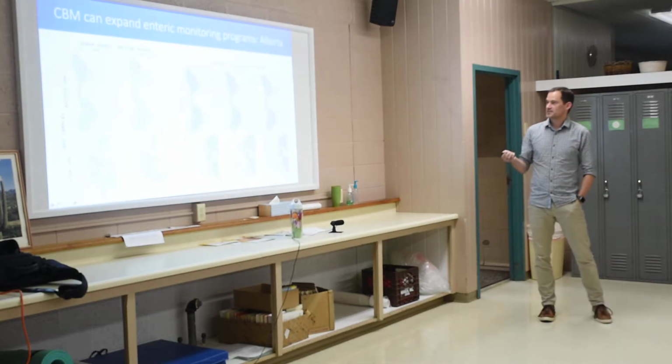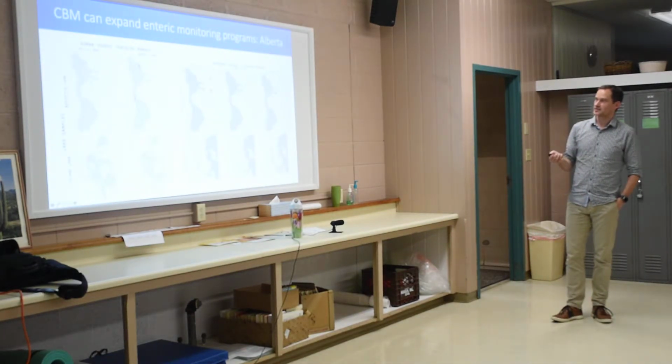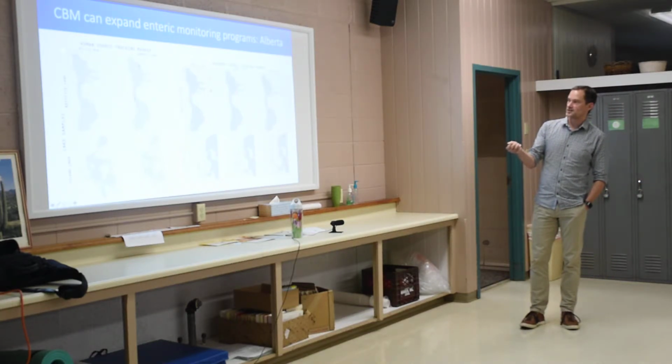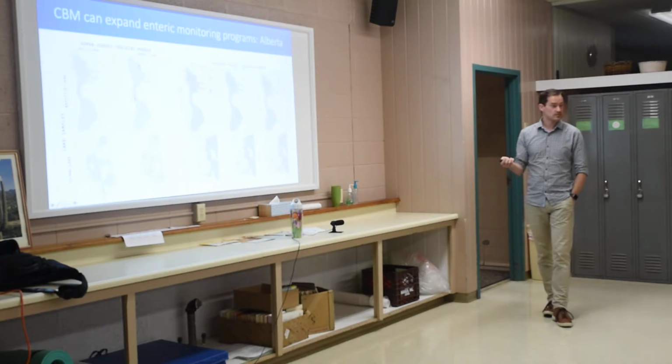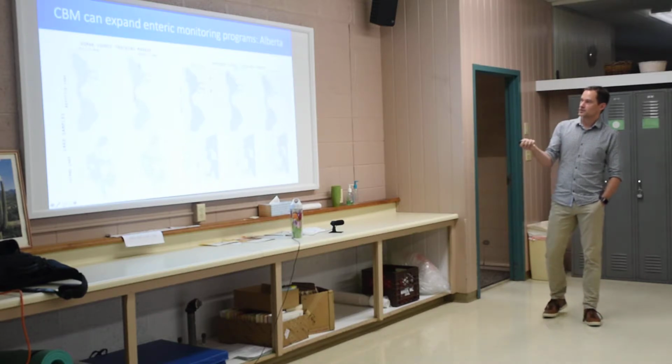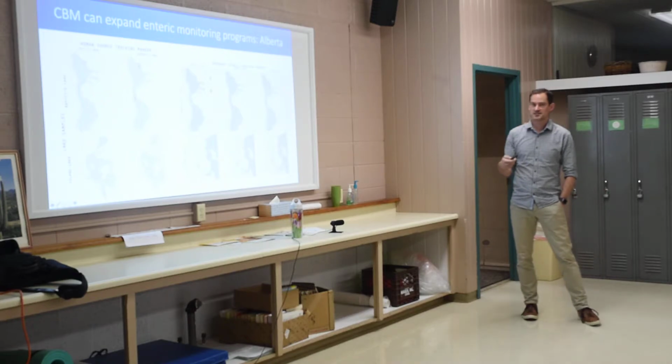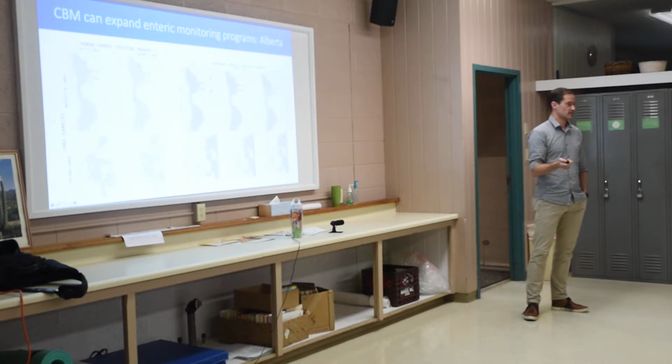In Alberta, we have some similar studies, although they're not quite as comprehensive. This is a Lake Baptiste and Island Lake in Alberta. This might be a little bit harder to see, but these little blue dots represent positive sites that were collected and gave a positive for human marker, HF183. And these little areas where there's a bit of color added to that blue dot, that means that you actually have exceeded some sort of level of HF183 at those locations.